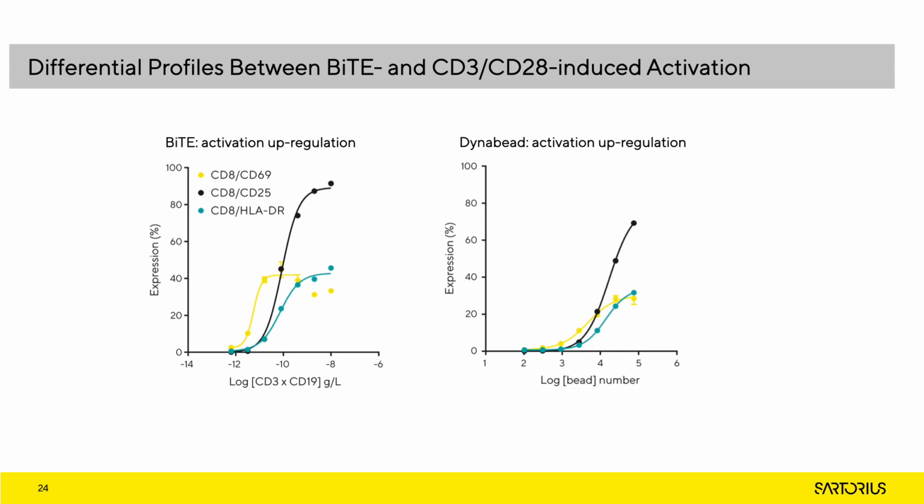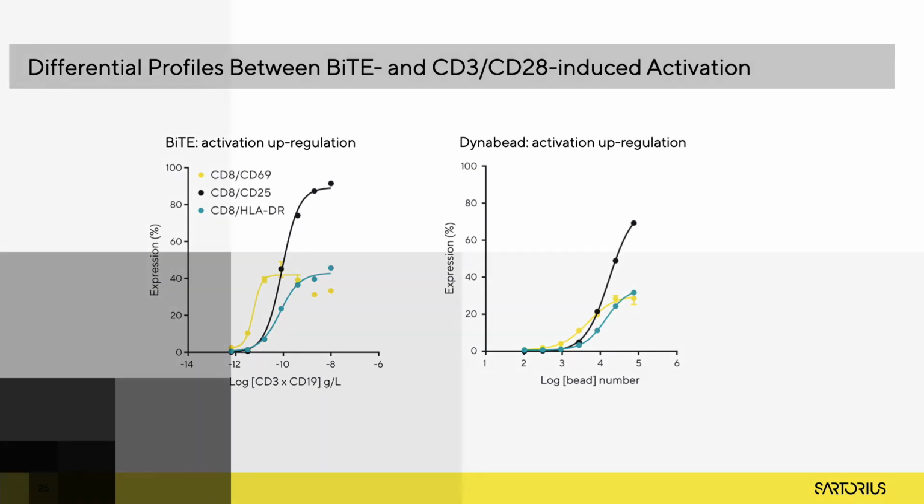to CD25 and HLA. Using the workflow to evaluate the BiTE against a broader CD3 activation has allowed us to tease out differences in the data, such as cytokine release and target cell death, whereby the specificity of the BiTE antibody allowed for more effective killing without a large release of interferon gamma, something which is important for developing immunotherapies so as to avoid cytokine release syndrome in patients.